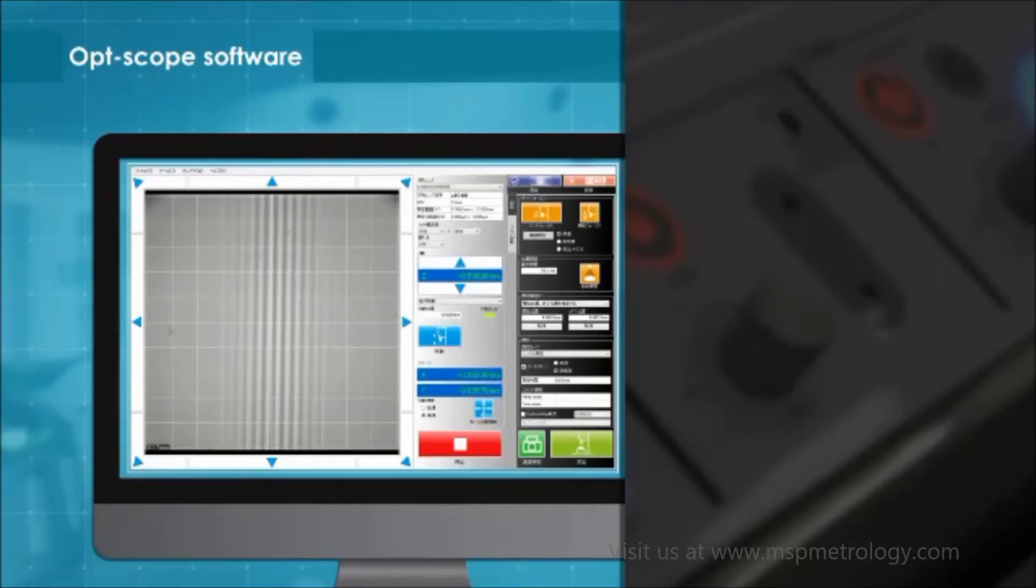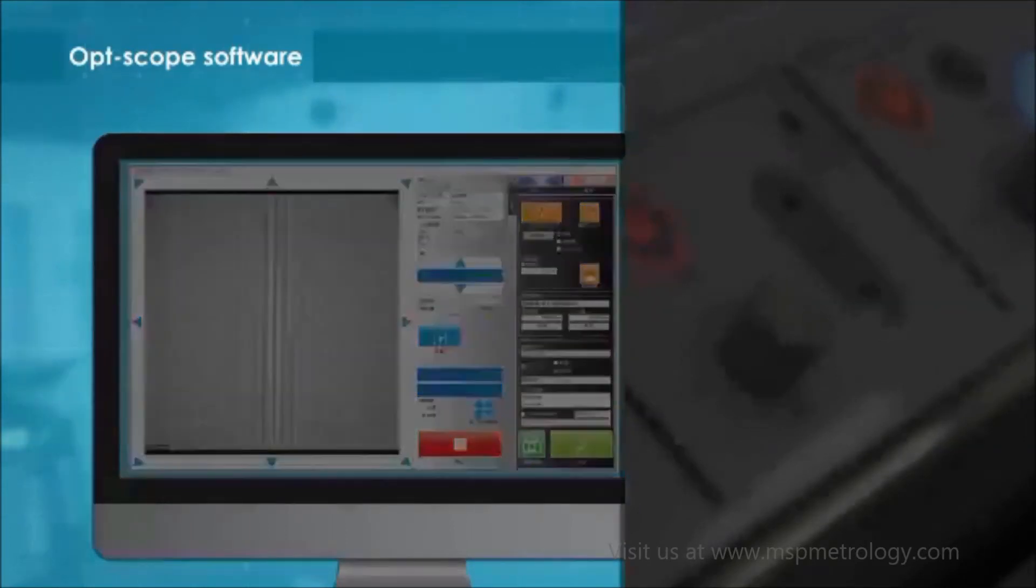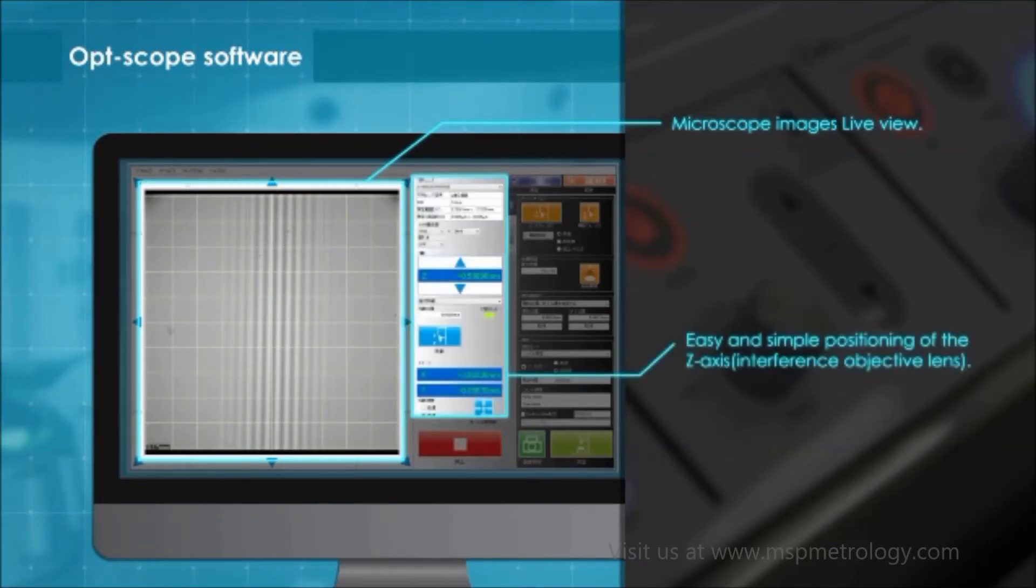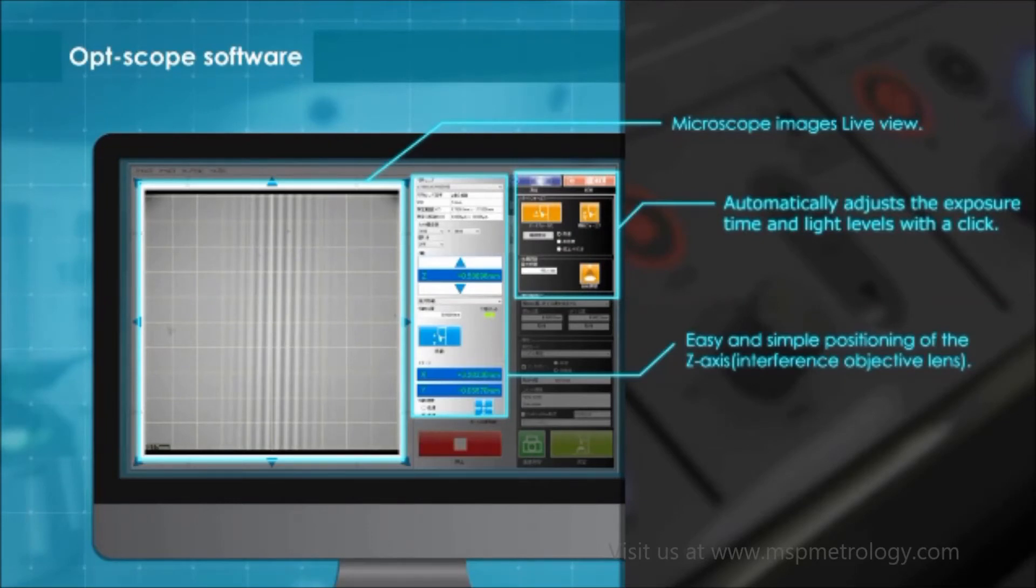Now here's an overview of the software. The measurement screen of the Optscope has a user-friendly interface that enables users to observe microscopic images in real-time, fine-adjust the objective lens, conduct one-click exposure, automatically adjust the amount of light, and set measurement conditions.